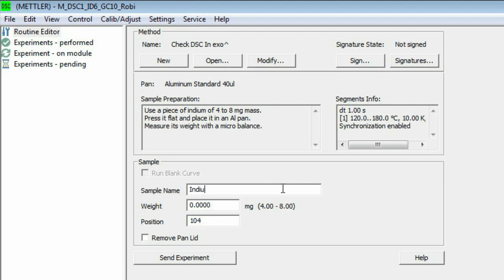A good name would be indium followed by the batch number used for the calibration. Enter the weight and enter the position number on the sample changer tray.